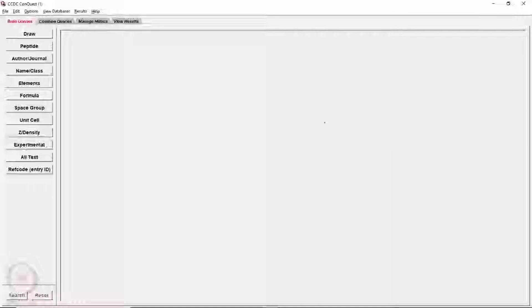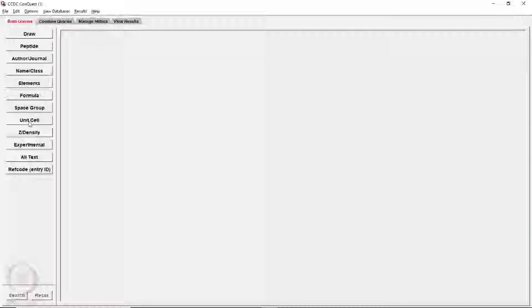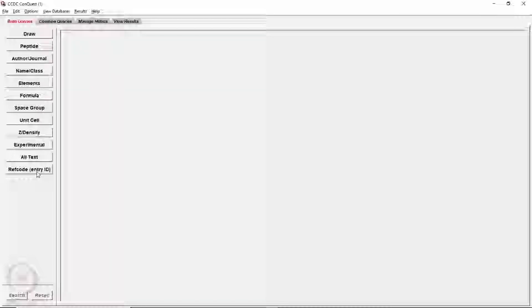When you open the software, you come to a drawing board where you have the option to draw a molecule or incorporate a peptide. You can choose author or journal if you know where it was published, and then give different searches like formula, space group, unit cell, Z and density, and some experimental details. The ref code is the unique code given to each structure deposited in the database.